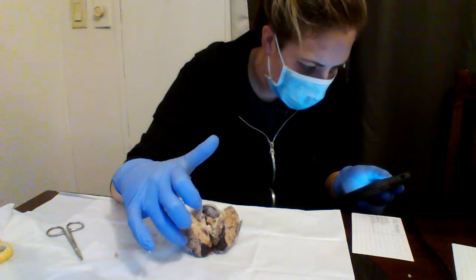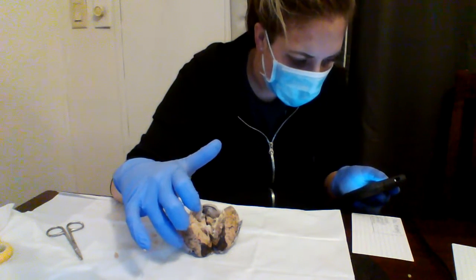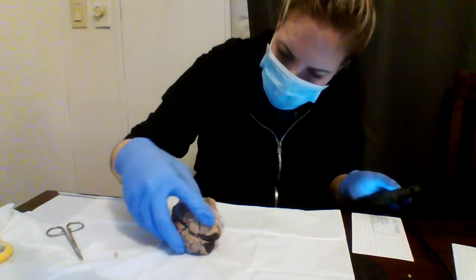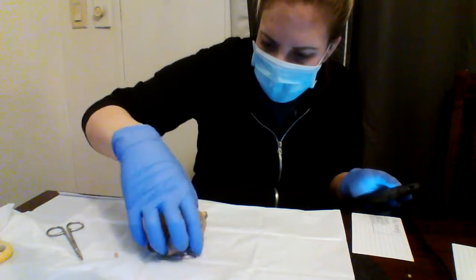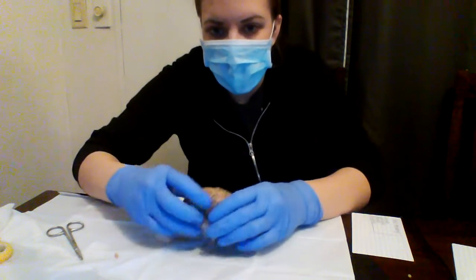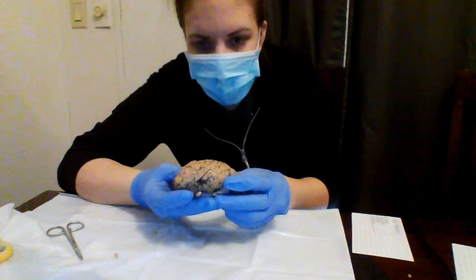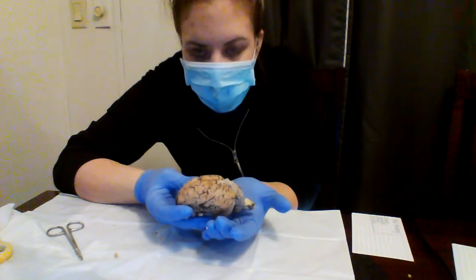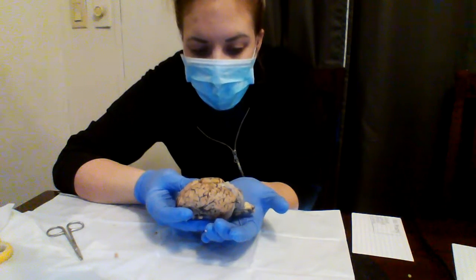If we were going to do a sideways view of it just so you can see. It has the casings on it, but I'll show you this side view. You can actually see the length of the brain here. It's a lot longer than a human brain would be.